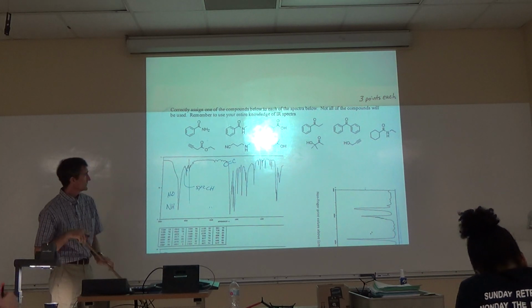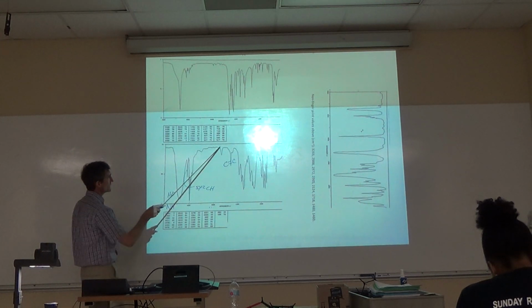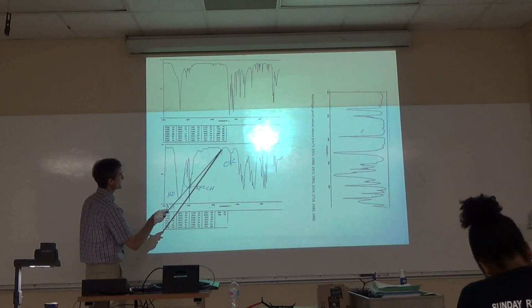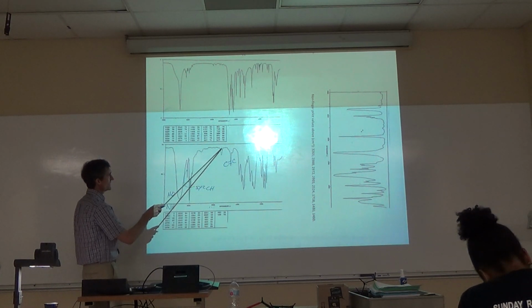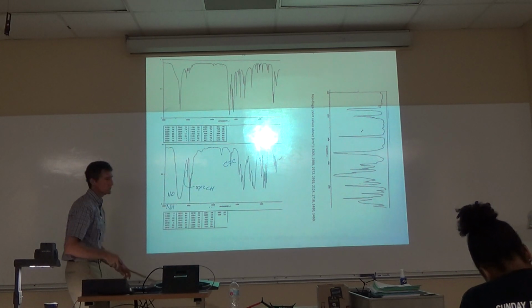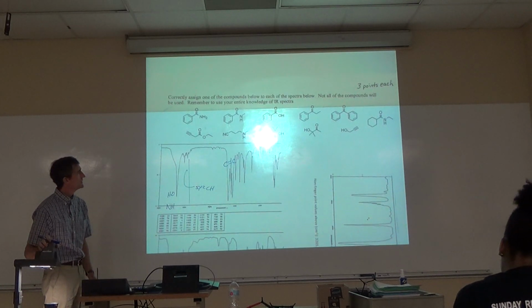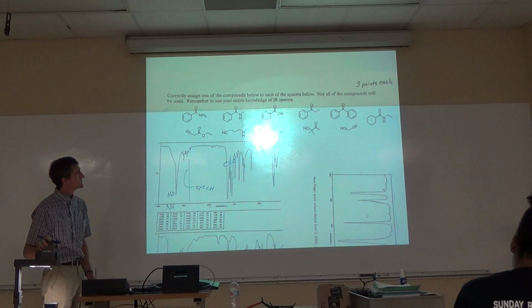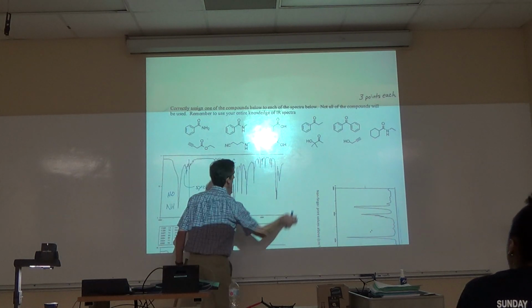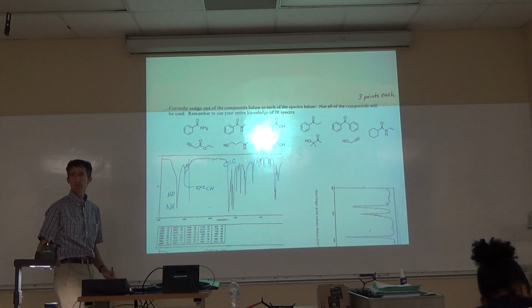Well, let's look at the right spectrum. It also really doesn't look aromatic. 1600. I don't know what this is here. That's kind of odd. Is there any other possible choice, though? I don't think so. The second one is that alcohol right there with the alkene in it. Yeah, how we doing? Good.